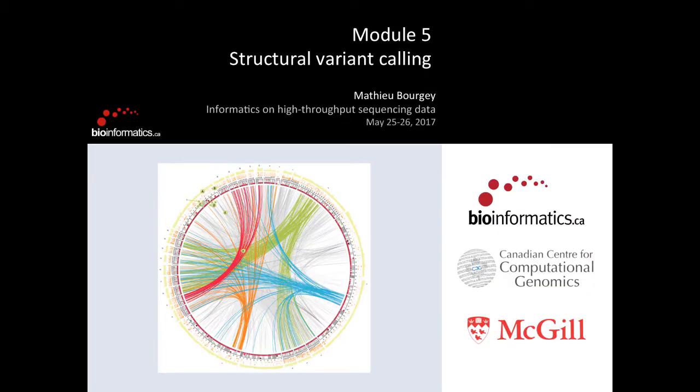Okay, module 5 will also be talking about variant calling, but another type of variant calling, which is structural variant calling, which I have to say is my preference. It's harder, more complicated, and wider in terms of what it covers, but it's more challenging, but I prefer it.